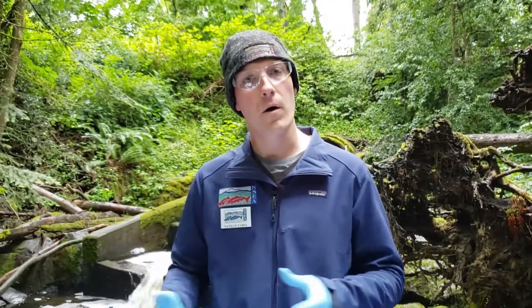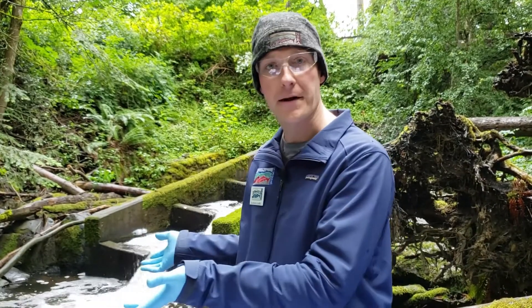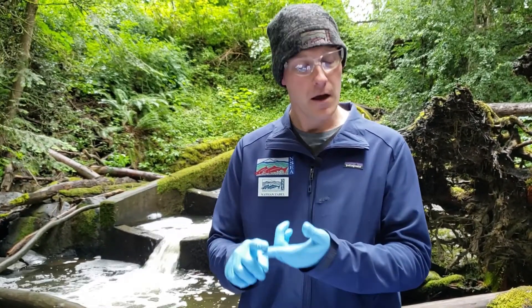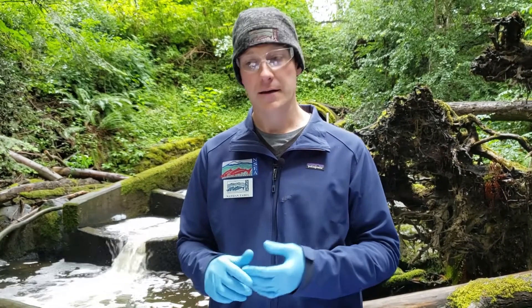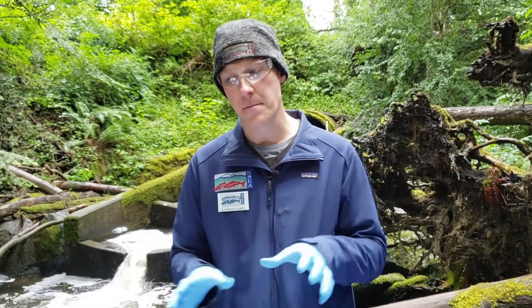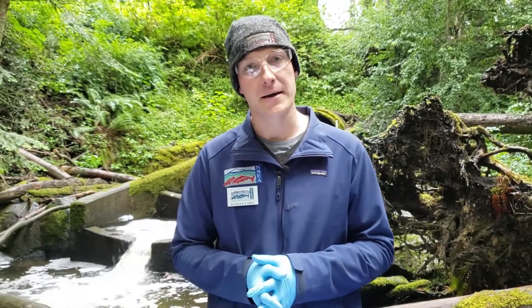Let's take a look at our water quality samples as a whole. Today we did three tests: dissolved oxygen, temperature, and turbidity of the water from Padden Creek. Our dissolved oxygen at 10 parts per million was excellent. Our temperature at 14 degrees Celsius was fair — slightly above the 13 degrees we would have liked. And our turbidity was zero, which also falls in the excellent range — giving us two excellent ratings and one fair rating for overall water quality of Padden Creek. I'd like you to take a few seconds to come up with a conclusion based on those parameters. What do you think about the health of Padden Creek based on the water quality?